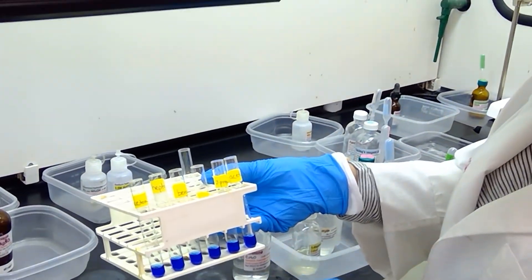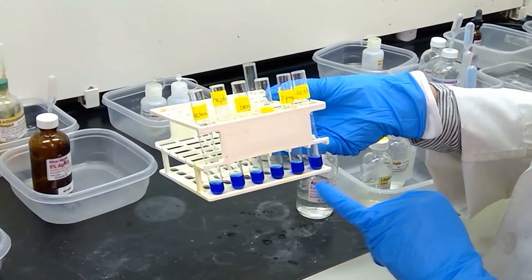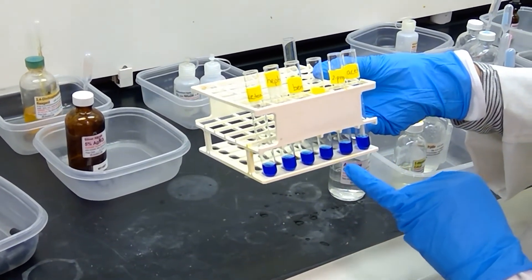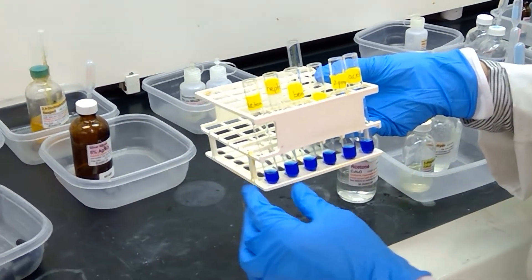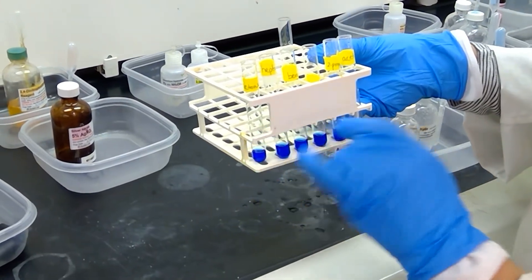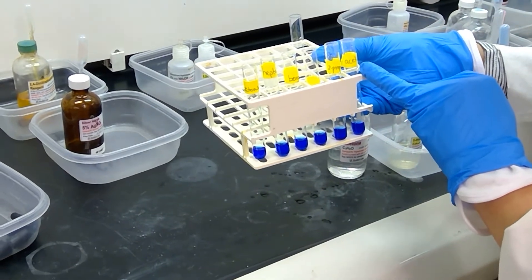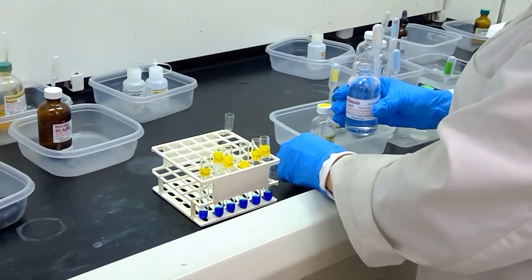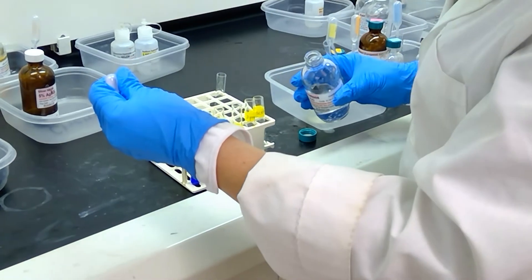So far in our test tubes we have Fehling solution A and B, and I mixed them together to create a homogeneous solution. We have this very nice dark blue solution in each of our test tubes. I'm now going to add two to three drops of sample to each one of the test tubes. We are testing the same six compounds that we had in the previous tests: acetone, heptanal, benzaldehyde, 3-pentanone, 2-propanol, and acetophenone. After we have added the appropriate amount of sample to each test tube, we're going to put these in a boiling water bath.